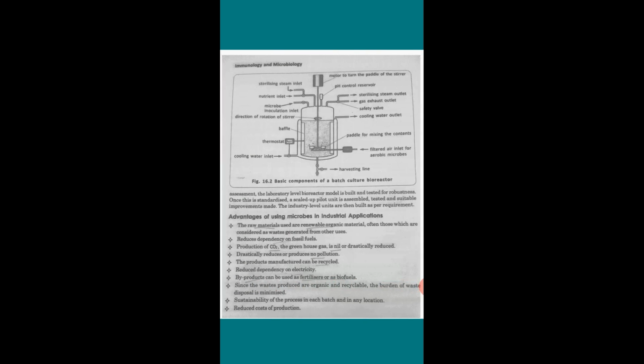The next one, foam breakers. Foam will be produced during the reaction of the microbes with the substances. So this production of foam will be prevented, and the flocculent formation will also be prevented. What is meant by flocculation? Flocculation means the aggregation of substances during the continuous agitations.